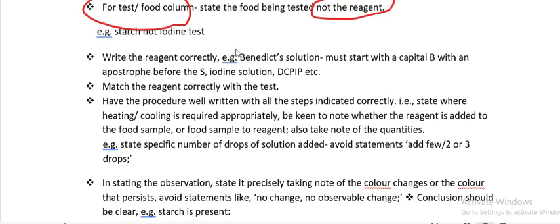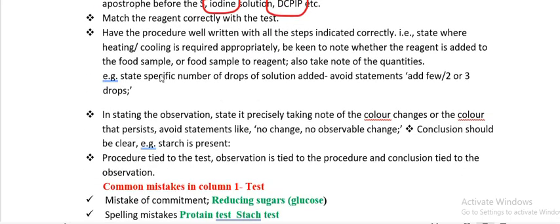Iodine solution should be written correctly. DCPIP should be in capital letters with no abbreviation dots and no mixing of capital and small letters. Match the reagent correctly with the test — for starch you use iodine solution; using Benedict's solution will give wrong results. Have the procedure well written with all steps indicated: state whether heating or cooling is required, and note whether the reagent is added to the food sample or vice versa.